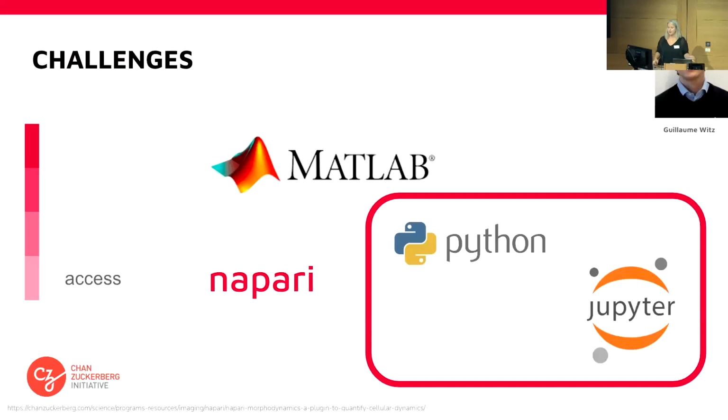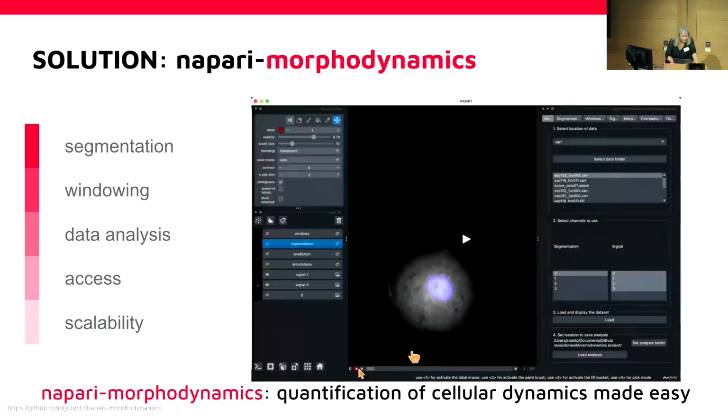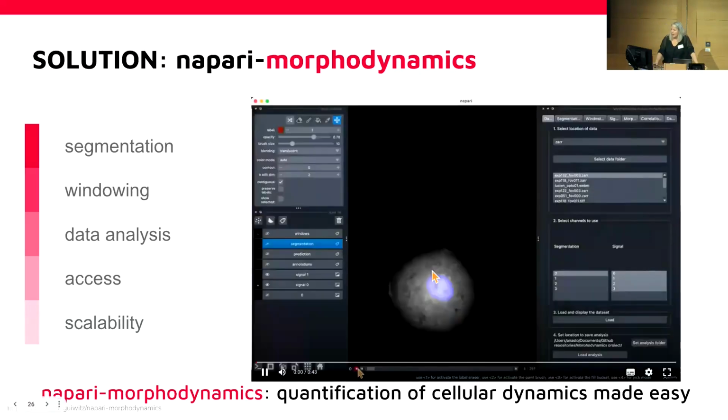Really. So he got funded for wrapping it up in a nice Napari plugin, because Napari became quite popular and very flexible and useful. So he did it. He wrapped everything together in Napari, and he also made it scalable because he implemented Dask computing to be even faster, and now you can also deploy it on a cluster. So here is a short demo if I still have time.